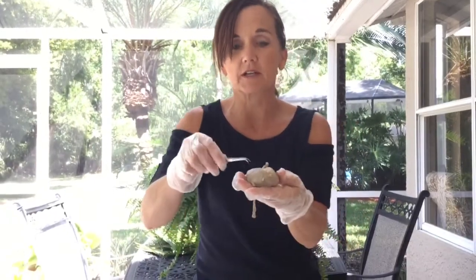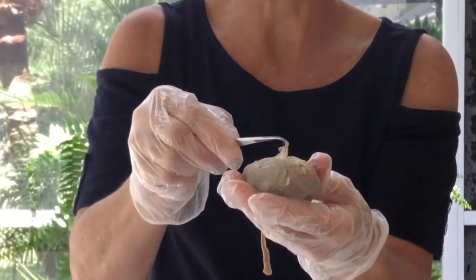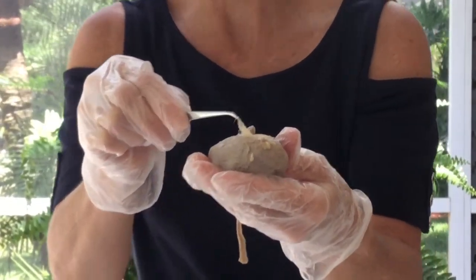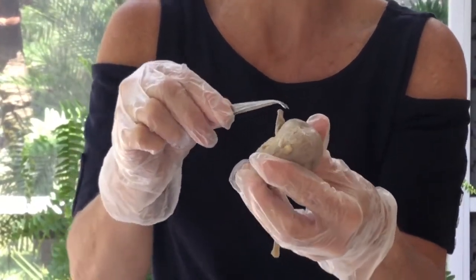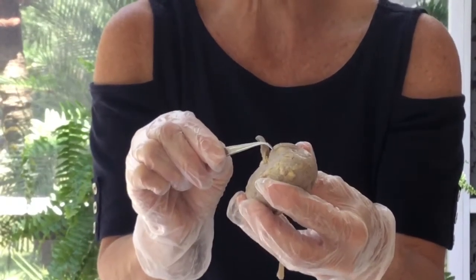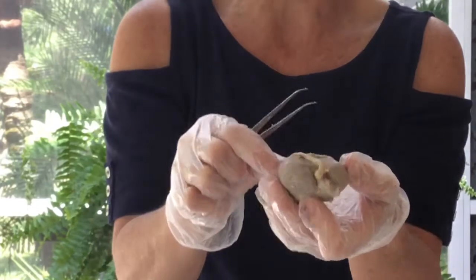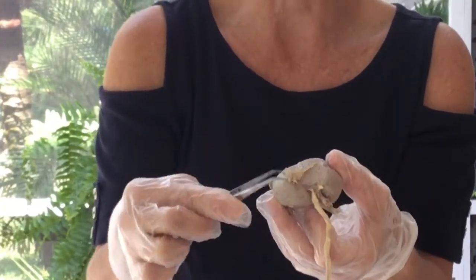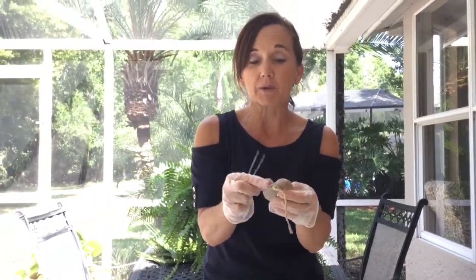The other thing before we get inside, I wanted you to see on the exterior, it has this natural film called the renal capsule. If you have one of these at home, you can actually peel it. It's like when you've had sunburn and you want to peel off that dead skin. It's this thin layer that pulls off. We don't need to pull it all off for our dissection, but I just want you to see that that is what this film is on the outside. Anytime you hear renal, that's talking about kidneys. It's renal function, might be what your doctor says. And so that's what we're talking about here.